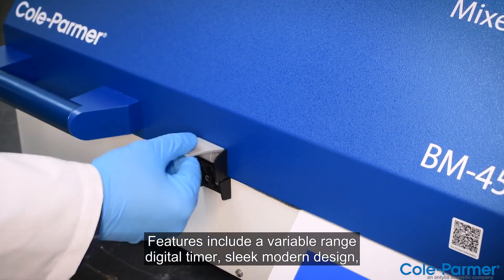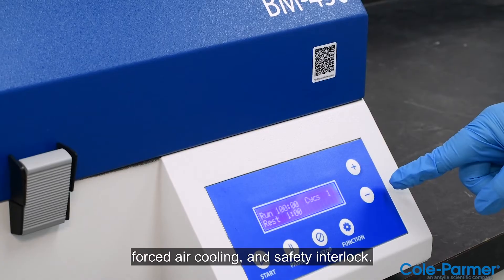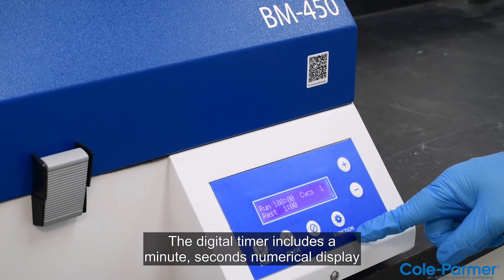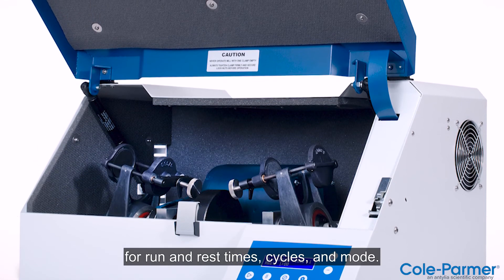Features include a variable range digital timer, sleek modern design, forced air cooling, and safety interlock. The digital timer includes a minute-seconds numerical display for run and rest times, cycles, and mode.